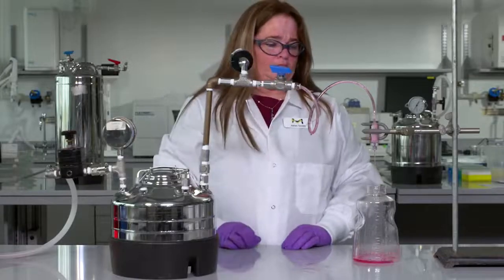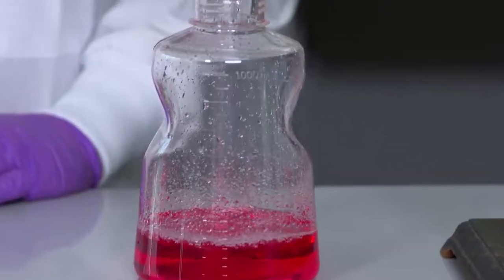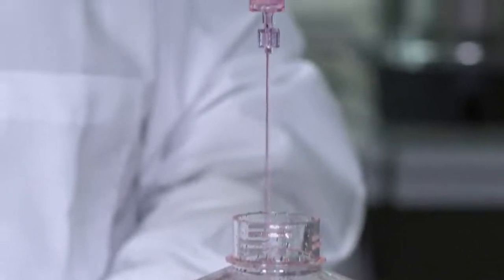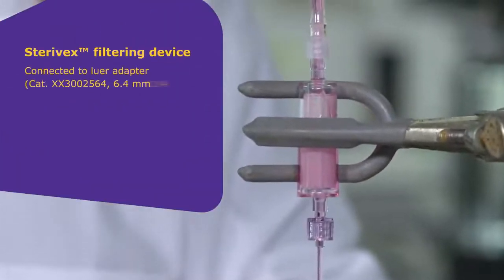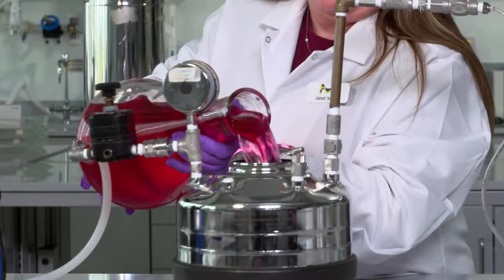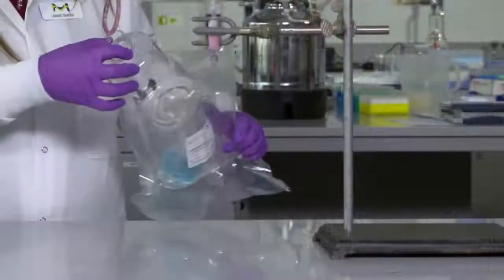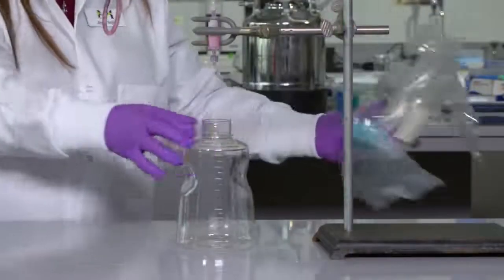The Sterivex units are non-toxic self-venting devices capable of withstanding pressures up to 3.1 bar. Sterivex filtering device connected to a lure adapter, 6.4 mm hose barbed to a lure lock adapter. Outlets have additional tubing or connections as applications dictate. Here we will be using a simulated media and sterile receiving flask to collect filtered medium.